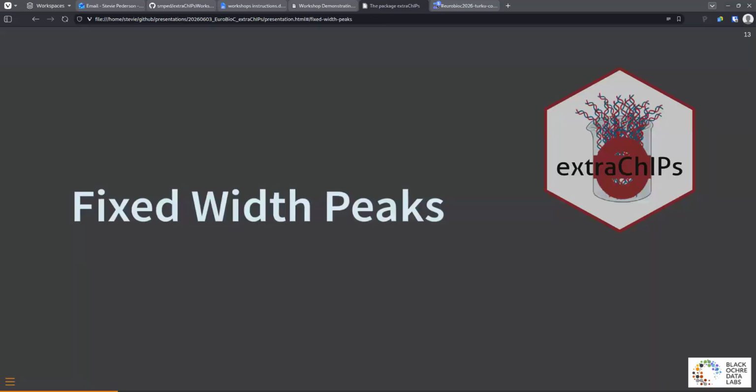All right. So that's the setup. We've got our regions we want to mask. We've got our annotation sorted out. We've got our genome information sorted out. We're ready to go. Let's do the fun bit. This is the analysis.